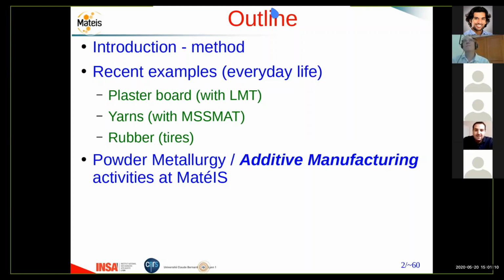So I'll try to be short. Thank you, Eric, for the seminar. Very nice. My question was the following. We are measuring density with the tomography, and from this density we want to go to texture, to the material texture. So how do you get the angles of the yarn from one cut to the next cut?